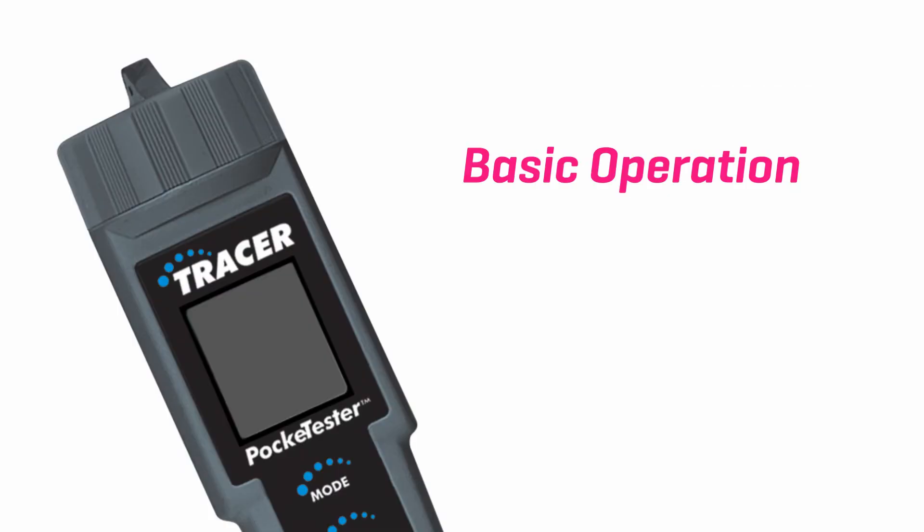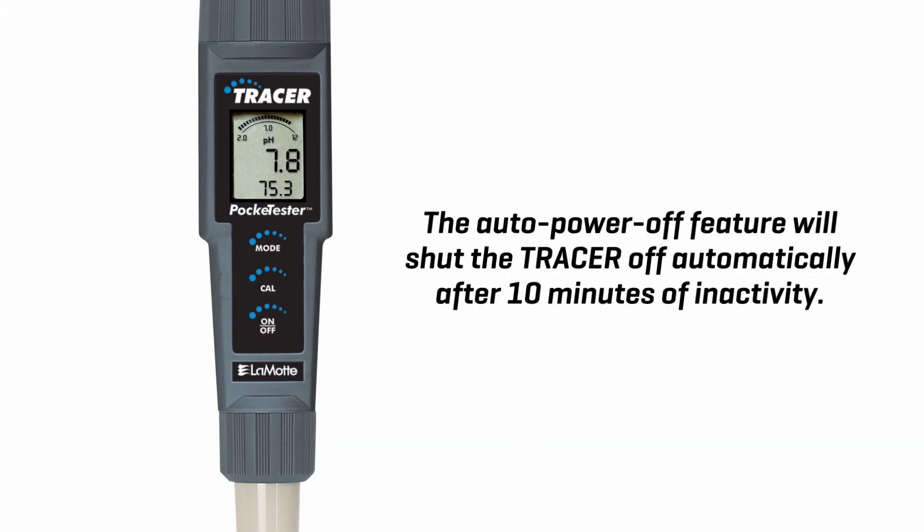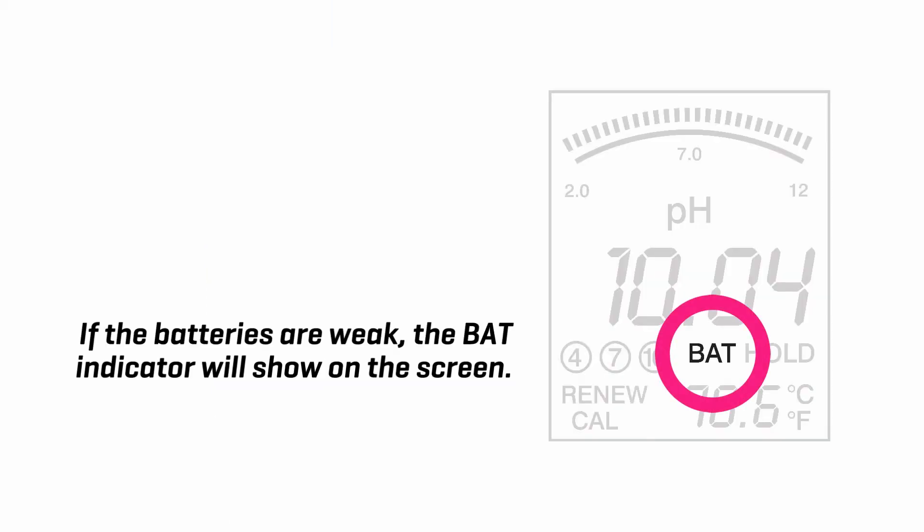Basic operation. Powering the tracer. Press the on/off button to turn the meter on. The auto power off feature will shut the tracer off automatically after 10 minutes of inactivity. If the batteries are weak, the bat indicator will show on the screen.